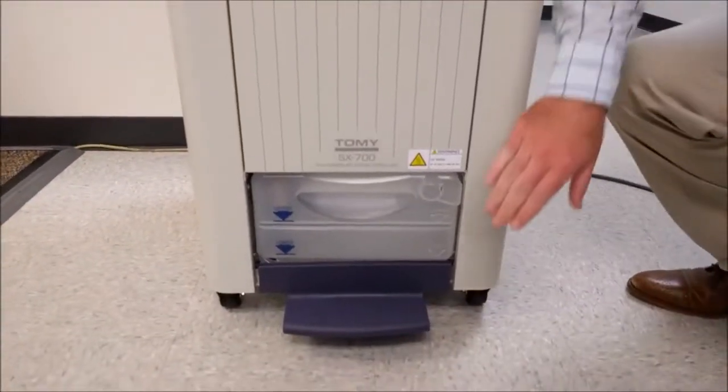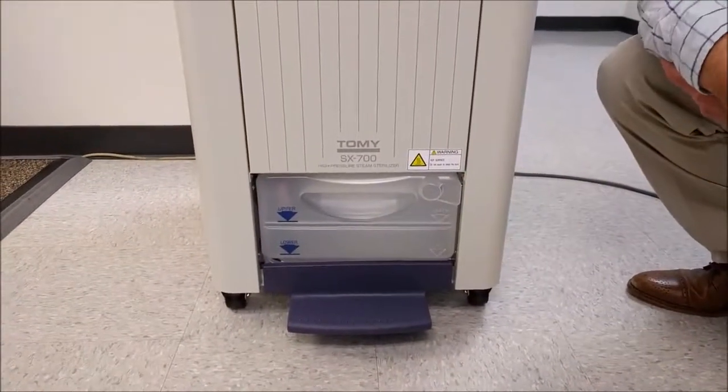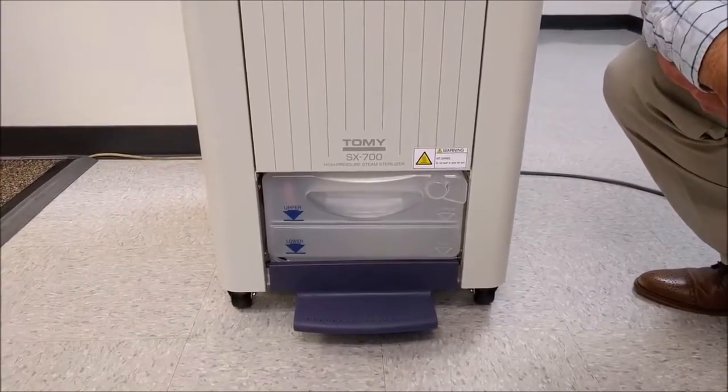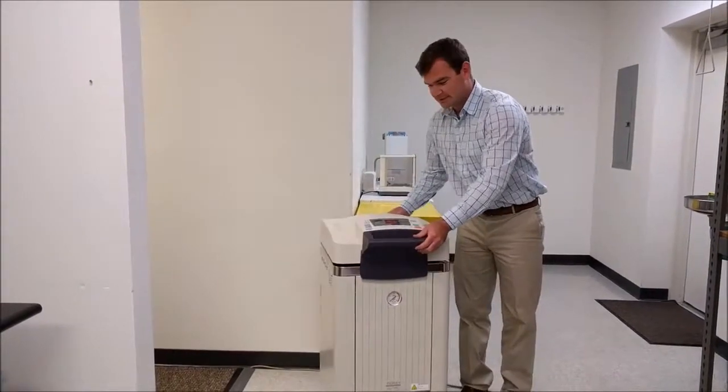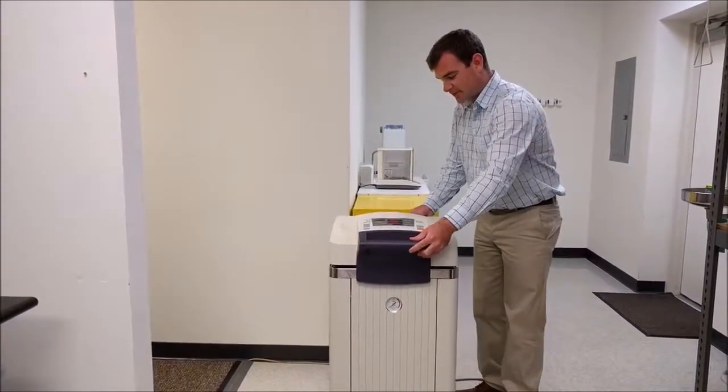The system is also equipped with an exhaust bottle, which allows there to be no plumbing connections at all. The system is portable and very easy to use thanks to the wheels — anybody could move it around to a different lab if they needed to.